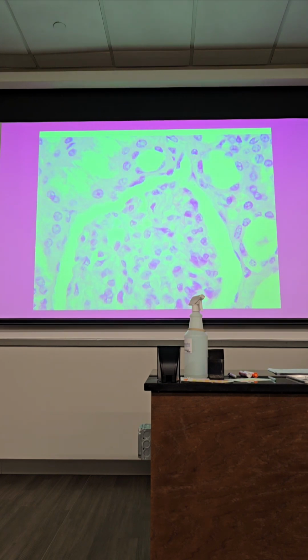The cortex. Okay, so the cortex is where you see all of that. Are you gonna ask us to identify the whole region, like the renal corpuscle? Yeah, if it's on your list. It is. Any place you'll see a whole bunch of glomerulus, that's from cortex. But if you're seeing a bunch of tubules like collecting duct, PCT, DCT, then it's a medulla.